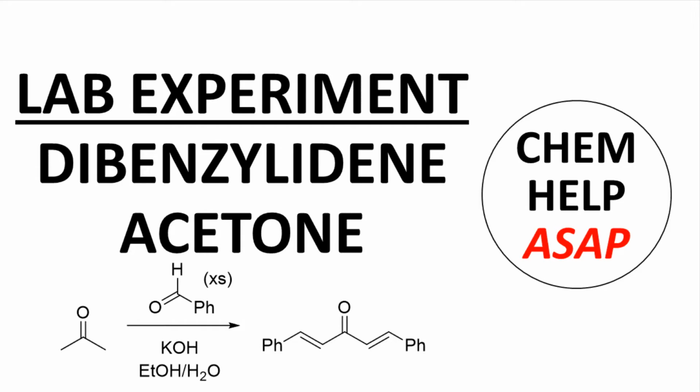In this video, we'll demonstrate the synthesis of a common ligand used in inorganic chemistry, dibenzylideneacetone. We will discuss the reaction, perform the experiment, isolate the crude product, and characterize the material. Handouts for the lab procedure and NMR spectra are available through links in the video description.